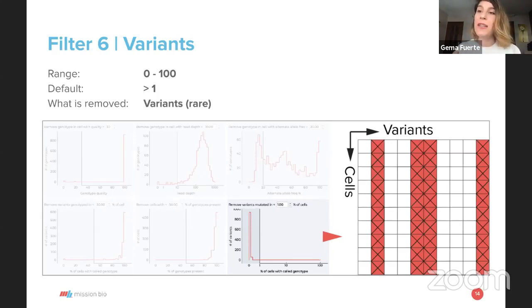If you load 3 samples, and one does not meet the criteria of these filters, but at least one does make the criteria, so it is within the threshold, you will see the rest. So here you can go low. You can go as low as you want. As I said, you can even go to 0, 1%.